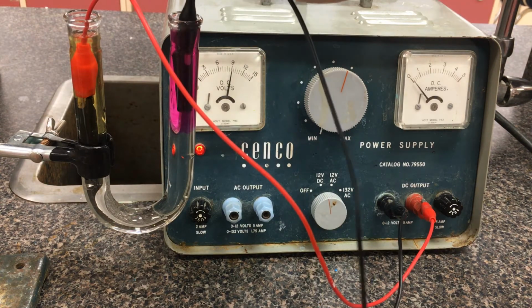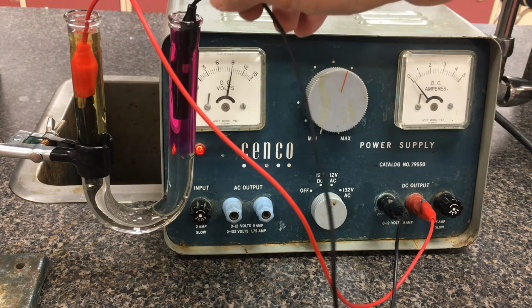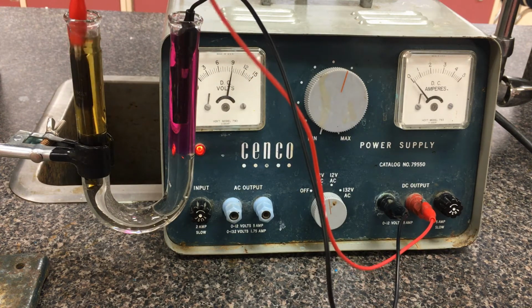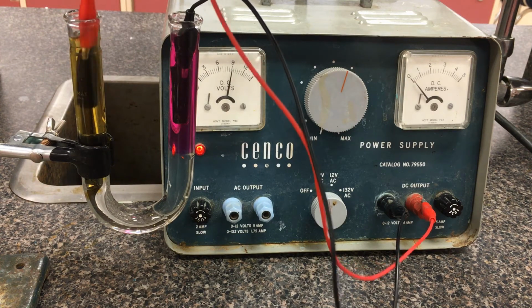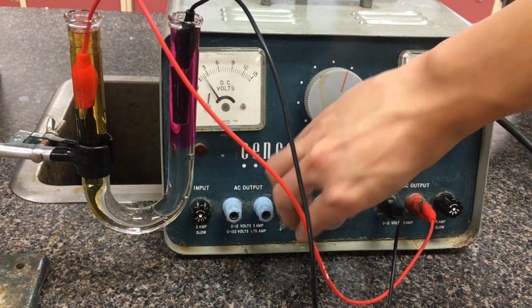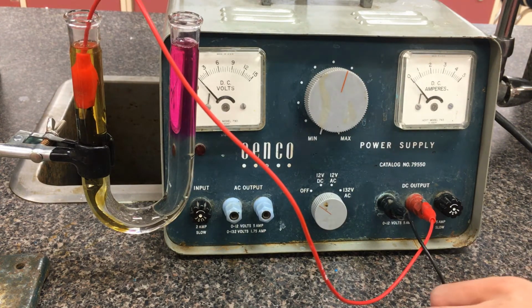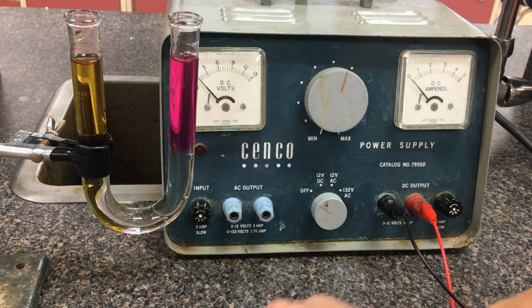This side, the phenolphthalein is responding, so a base is being created, or it's getting less and less acidic. On the other side, again, you can figure out what chemical we're forming, and it's giving us a yellowy brownish color. So again, I'll just flip off the power source. I'm going to pull out these leads to stop the reaction, and hopefully we can have a nice comparison with what the overall solution looks like. So 2 ends.